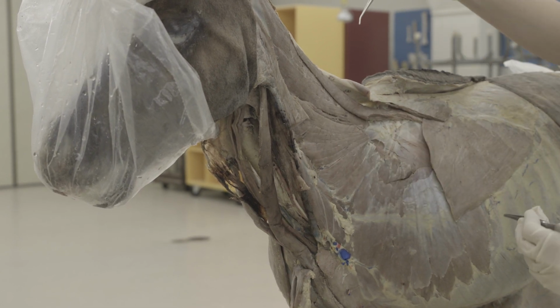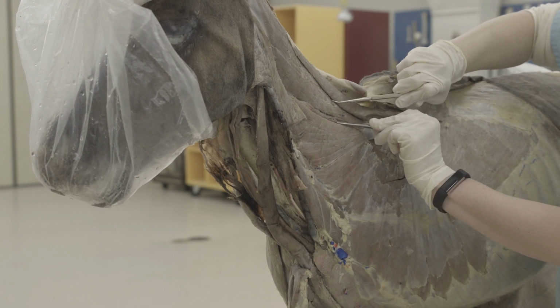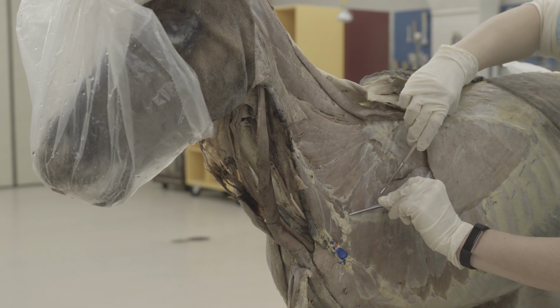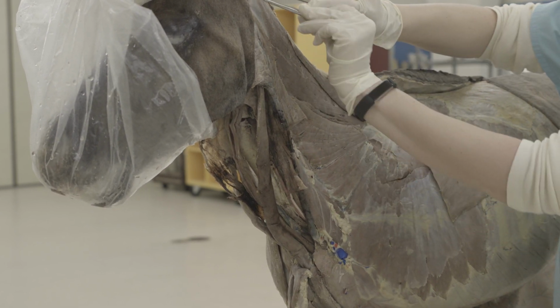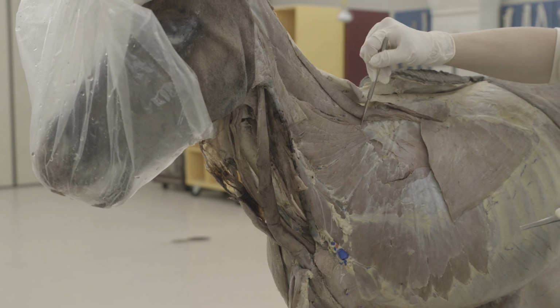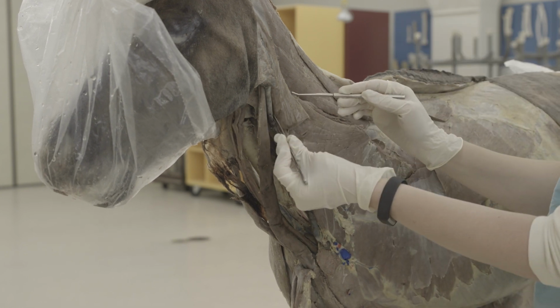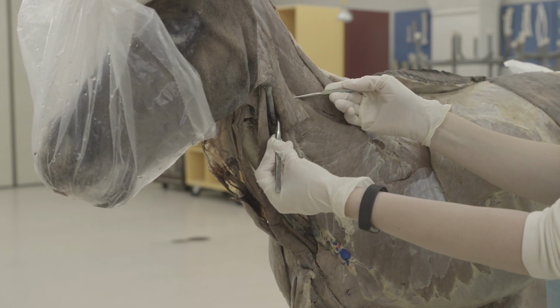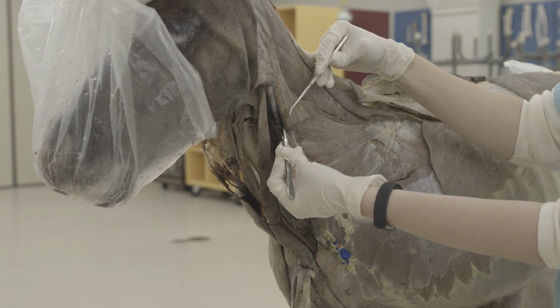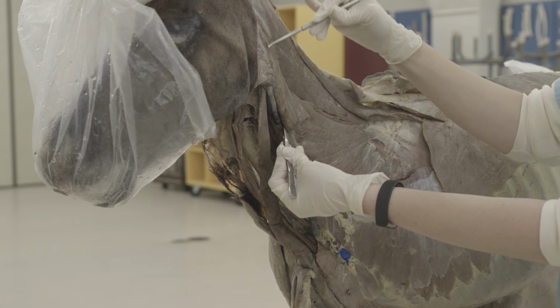And then you want to find the splenius muscle. So the splenius is in between your cervical rhomboideus and your serratus ventralis cervicis, which is right here. And the splenius is this kind of triangle in between there. So splenius, you want to uncover that. Then you also have the stump of your brachiocephalicus muscle here, where you detach that limb and cut it. So you want to just find the stump, and this is just the clidocephalicus part, and this is clidomastoideus in the pony.